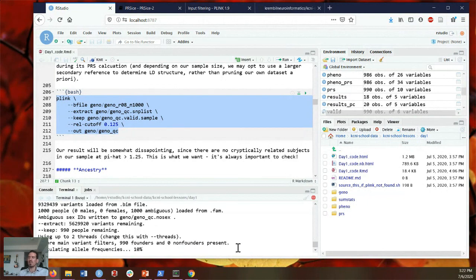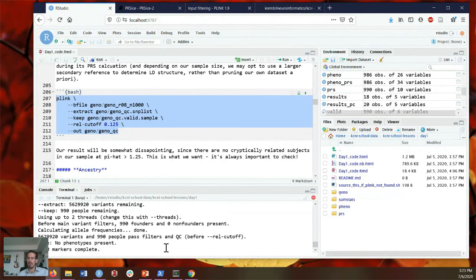I suppose you'll always be able to see this output in the log file that it writes, which will always update every time you run a new set of commands. It will print everything, so you'll be able to go back and check, but you won't be able to see the progress of the job as it's writing these things out.